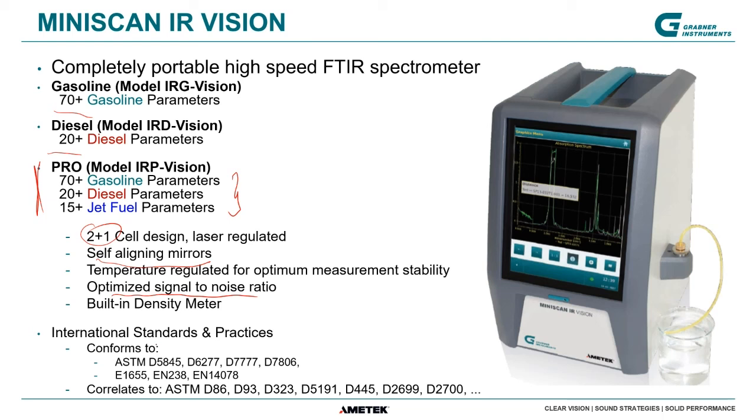There are international standards and practices. This is for oxygenates, for benzene. That's basically the density meter standard which is in there. This is for biodiesel. Then corresponding EN standards. And then, of course, a wide range of standards we are correlating to.